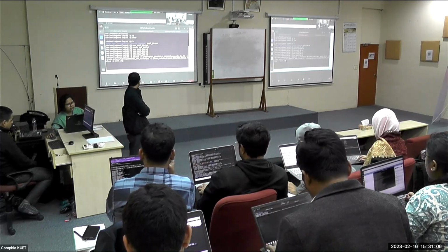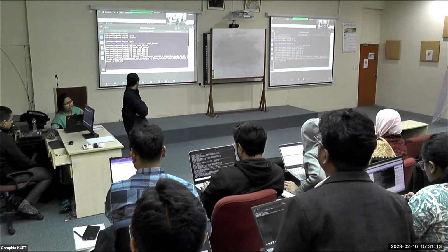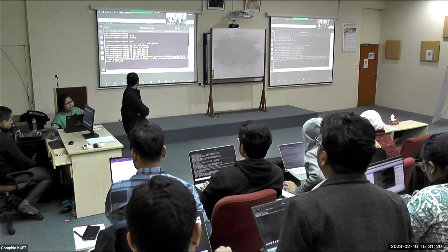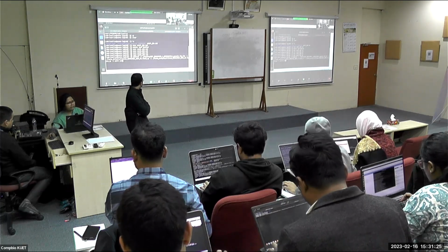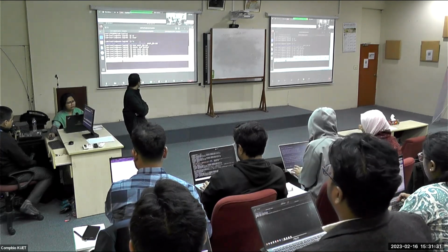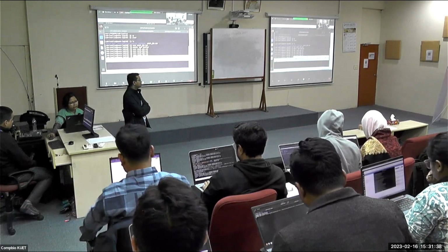Then -1. Inside the FastQC analysis folder, you have the trimmed file. You will take the trimmed R1. Then for number 2, you will get the trimmed R2. And then -S is the E. coli.sam. You can construct this command, then copy it again. Don't press enter, just copy it. You can copy it using Control-Shift-C or just right click and copy.